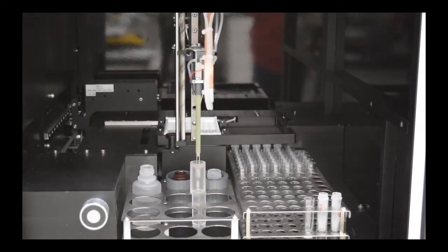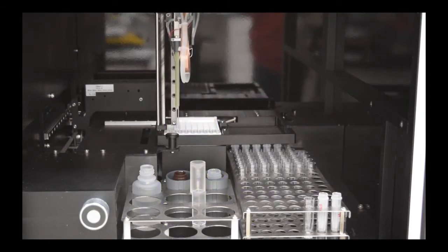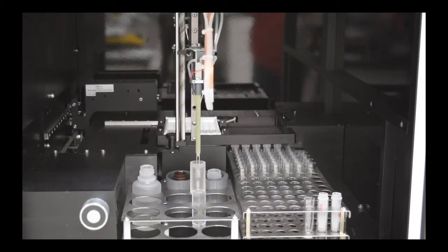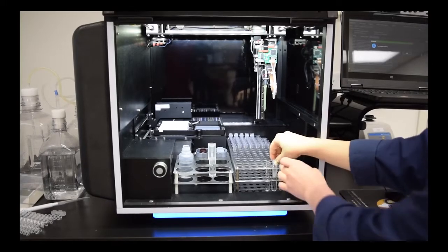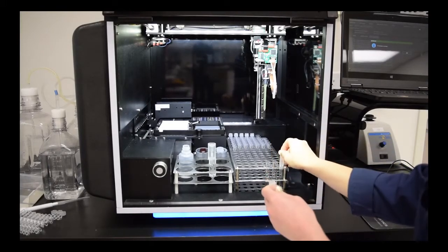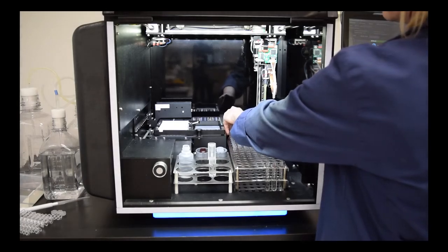The probe itself is responsible for diluting samples if needed, washing the plate, and adding each of the reagents. The design of the probe allows for precise sample dilutions as low as 1 microliter. It also does not use any tips or reservoirs, eliminating most waste that is normally associated with running an assay by hand.